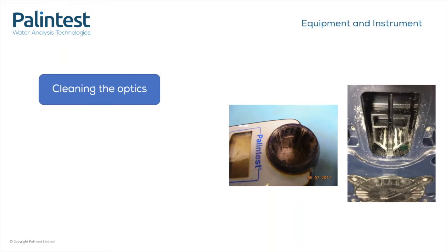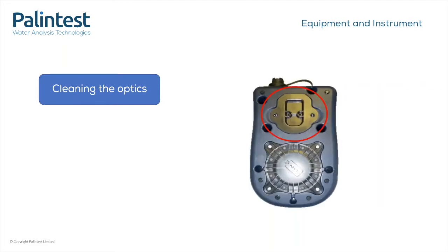To do this with a compact, you just use some anti-static foam and a lint-free cloth to clean the space you put the tubes in. But for one of our larger instruments, like a 7500, 7100, or a Palintest 9, 10, or 25, then you need to remove the base plate. This is on the bottom, and it needs to be unscrewed. After you've unscrewed it and cleaned it, make sure you screw it back securely in place to preserve the IP67 waterproofing.